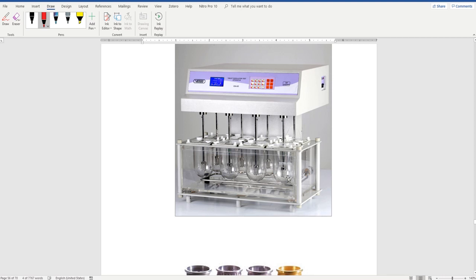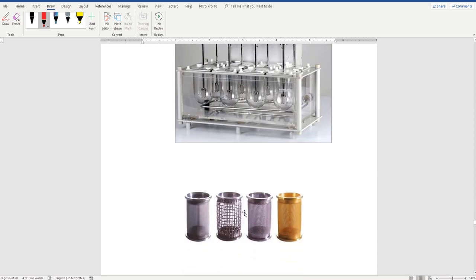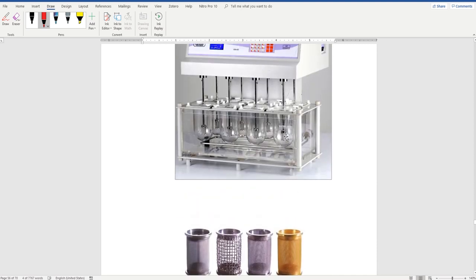Is it clear? طيب, you will see here shaft, and the bottom of the shaft is connected with a basket. شوف تطلع هون هذا basket. أيوه, similar to this one. Now each one will have a basket at the bottom. طبعا before we fit the basket into the shaft, we have to add the unit, the tablet.